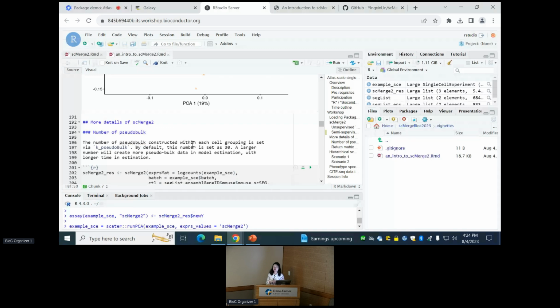If you still want to identify whether the batches share common cell types or have distinct cell types, you can still see that after integration. This is actually to guide the integration and correct the batch effects by looking for similar biological variation across the batches. So it's not forcing the clusters to be together.